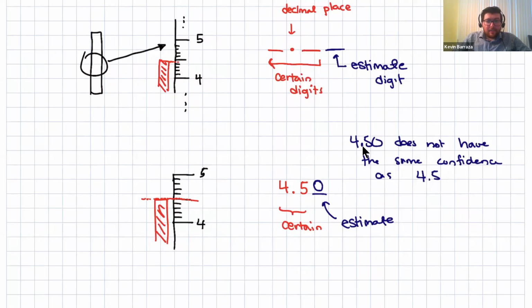So that is going to be the first thing. The second thing that we do is, and this is sort of the post lab of the experiment, which is also found in the report sheet, to do conversions with those measurements.